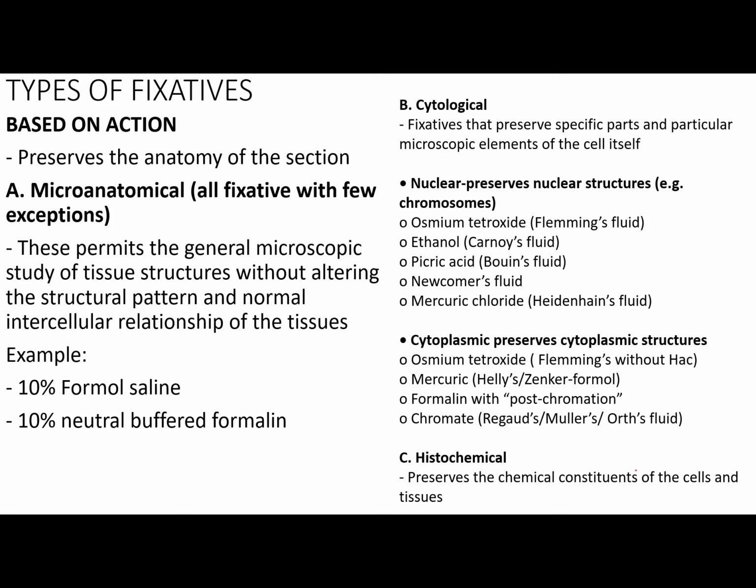So, sa microanatomical class, na maintain niya yung original appearance ng cell, yung original appearance ng tissue without any type of alteration. A very good example of a microanatomical fixative class is your 10% formal saline and your 10% neutral buffered formalin. Now, another type of fixative under based on action is yung cytological.